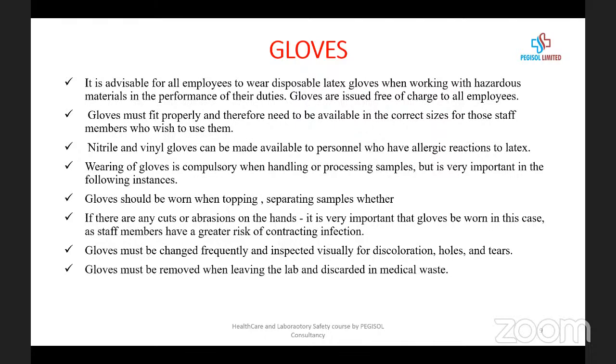There are some persons who are allergic to latex gloves, so you can use nitrile gloves or vinyl gloves. Now, wearing of gloves is compulsory when handling or processing samples. So when you're handling samples, you're processing samples, you must wear your hand gloves. On no occasion should you use your bare hand to carry samples, whether you are just examining the samples or whether you are processing the sample.